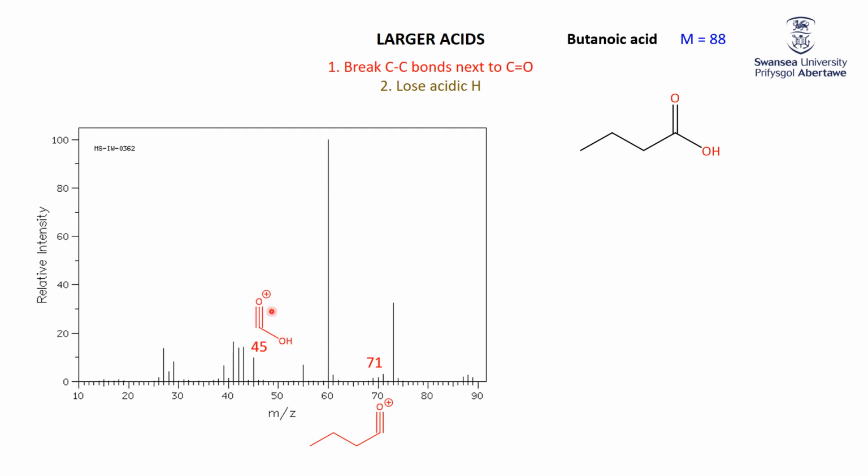So there's that peak, and of course that 45 acylium ion is going to be present in virtually every mass spec of an acid. We can see we got some other old favorites. Here's 28 there, that's the CO triple bond. There's 29, you can see 29 coming from fragmenting to give us a CH3CH2 plus. We got 43 right there coming from CH3CH2CH2 plus.